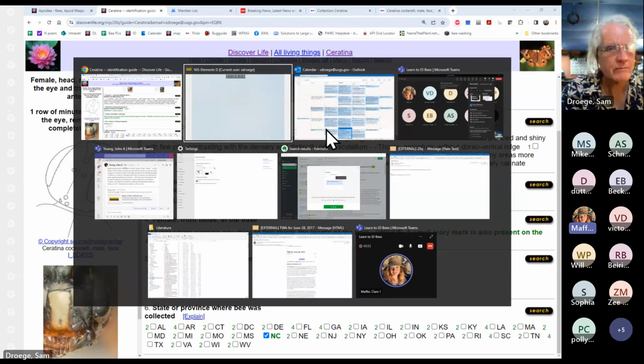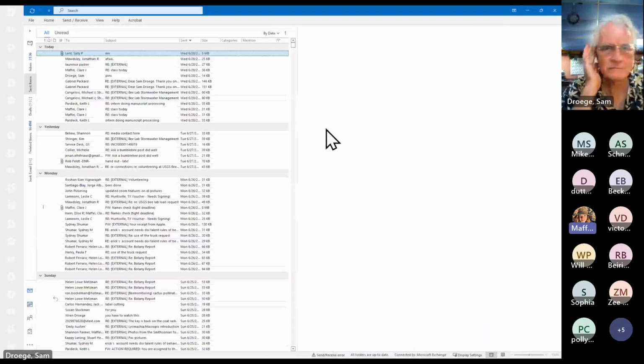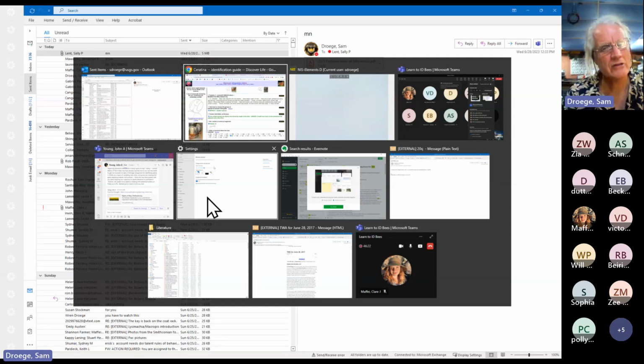Mesoscutum between medial line and notauli, and posteriorly more densely punctate. Punctures separated by equal to or less than 1 puncture diameter. Color more bluish. And I think you had a really blue one right there. That one was like so oceanic. Right. So that bluishness does come up, but I found that as you go to the north, including stuff that Sandra had determined as floridana from molecular data, was the same color blue.